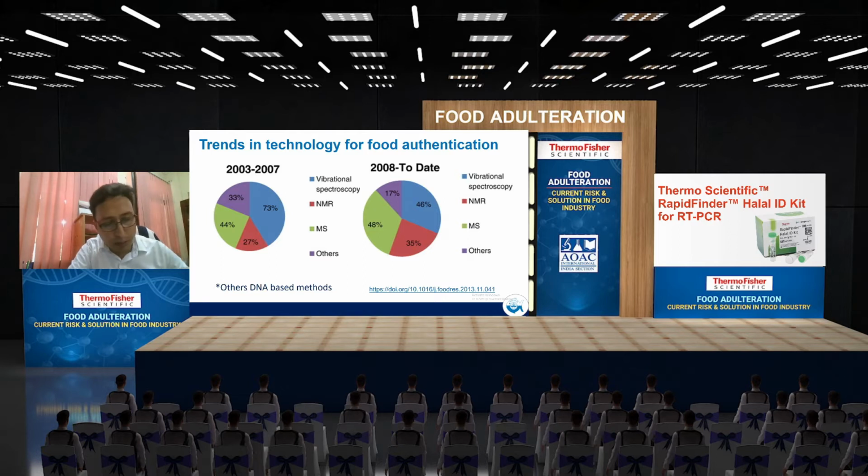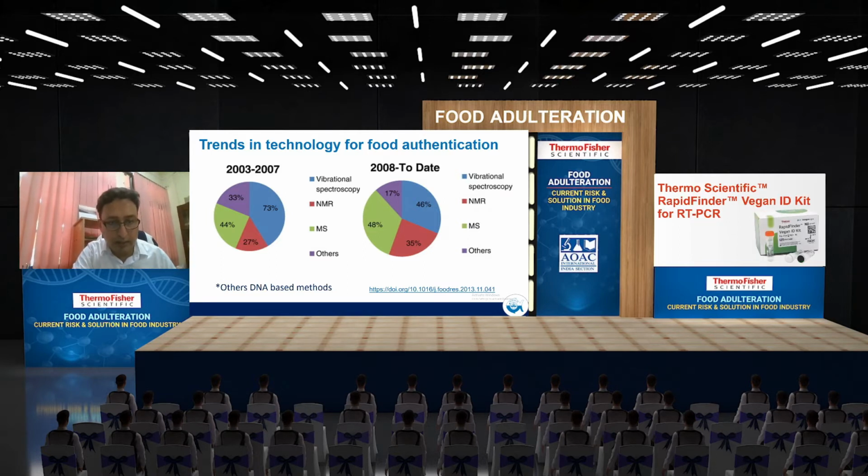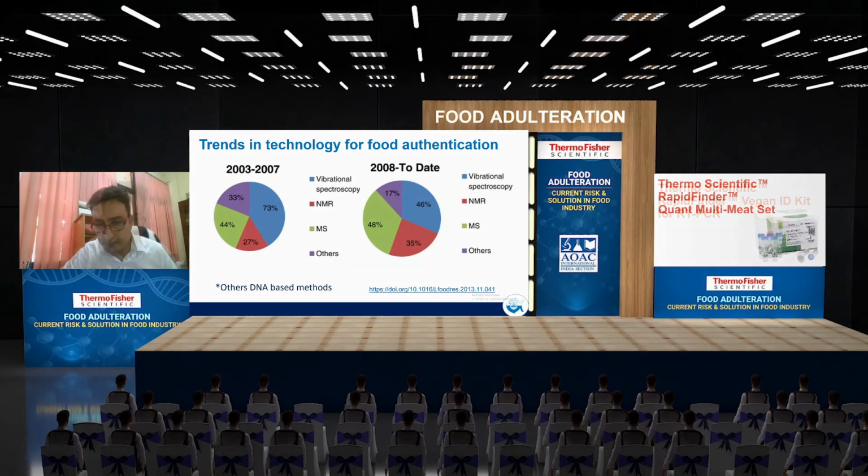So from here onwards, it gets a bit technical. In this slide, I'm trying to show you a summary of the different technologies available for food fraud detection.